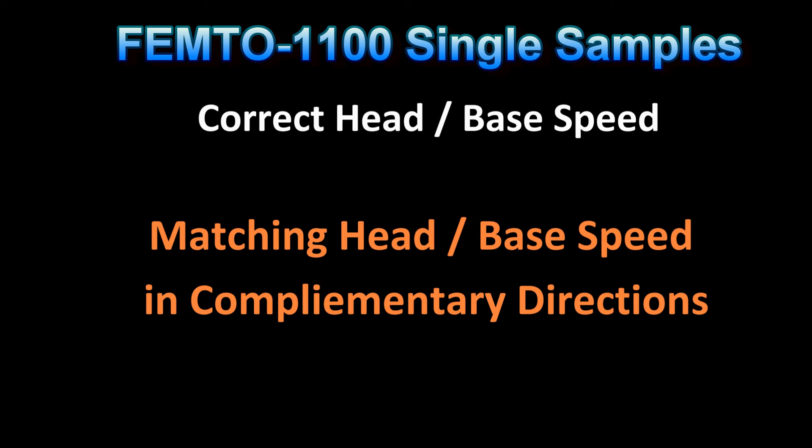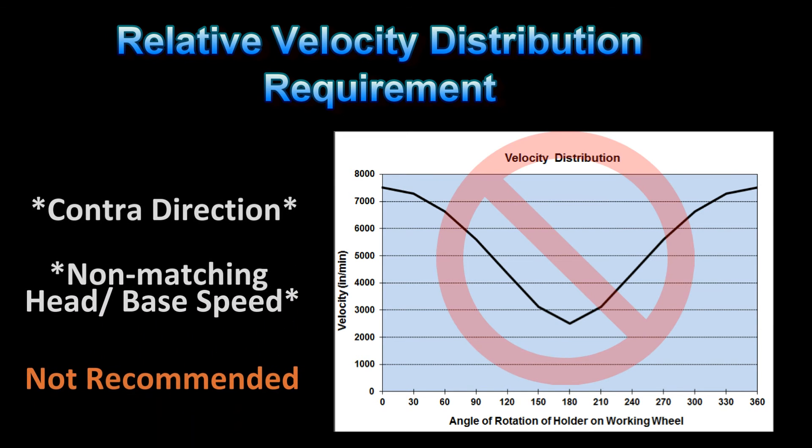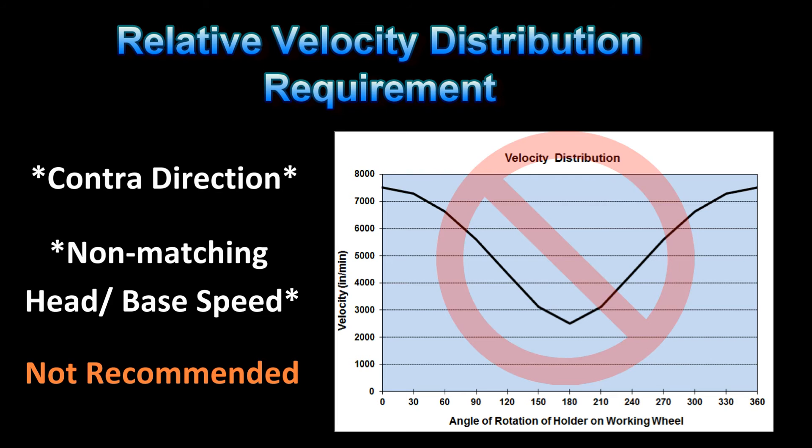Let's discuss both the incorrect and the correct head and base speed used for sample preparation of metallographic specimens. The worst combination of head and base speed is to run the head in the contra or opposite direction, especially if rotating the head and base at the same but opposing speeds. Computer analysis of disk-on-disk polishing shows a very high relative velocity distribution for contra grinding. This is analogous to a hammering effect — not only does this result in uneven grinding, it can also significantly damage the microstructure, especially metallographic features such as inclusions, graphite nodules and flakes, or other features of interest.